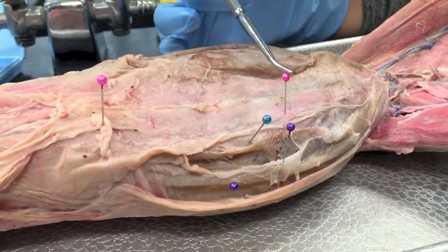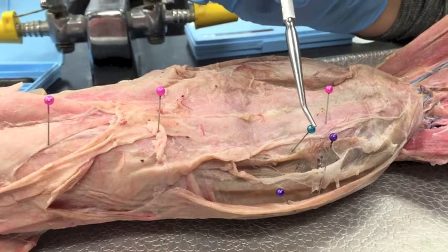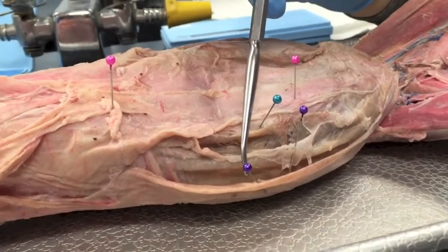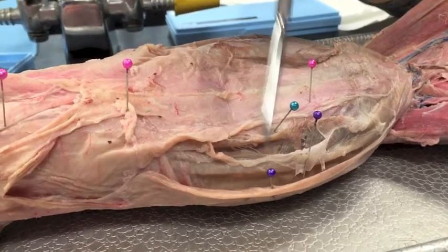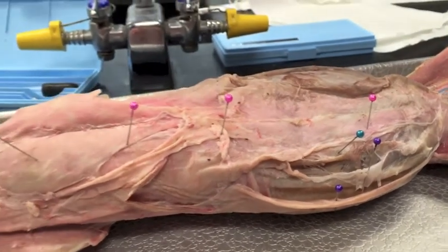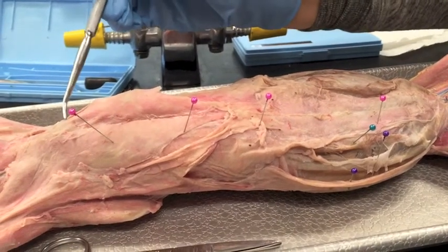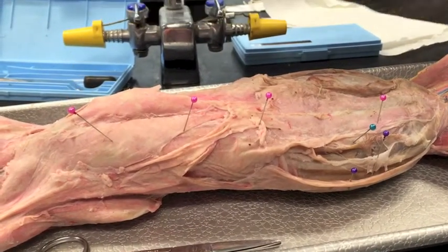The rectus abdominis, the transverse abdominis, internal oblique, and the external oblique. Why is there so many pink ones? Because the rectus abdominis goes all the way up here.